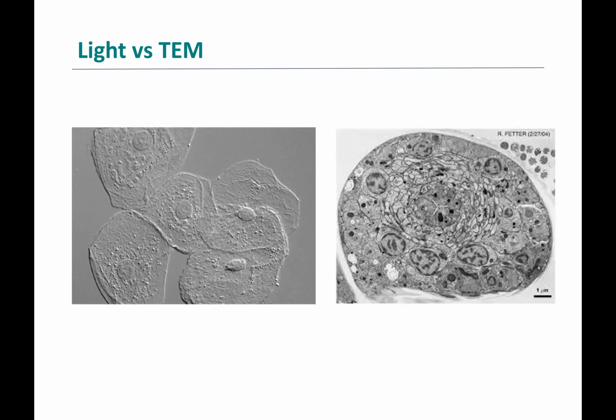Let's look together at two eukaryotic animal cells. Both are in grayscale, but I want you to notice the difference in detail. Okay, so this on the left is light, and on the right is transmission. So you will be asked to determine what kind of microscopy different images were generated with. So again, take a look at the amount of detail. Do things look flat? Do they look 3D? Or are they on a black background with bright colors?